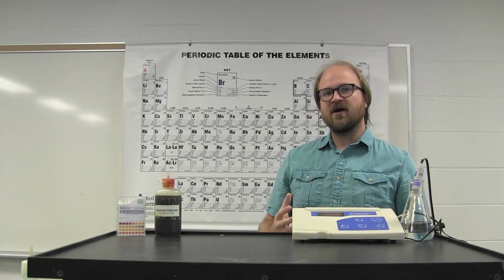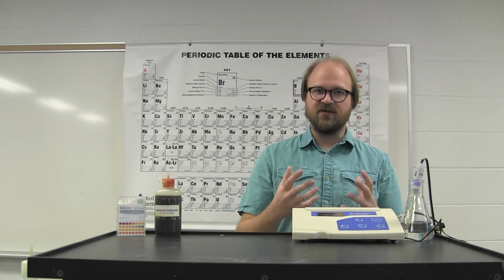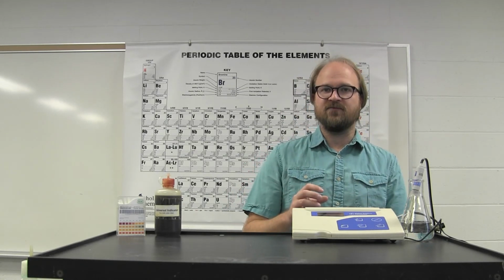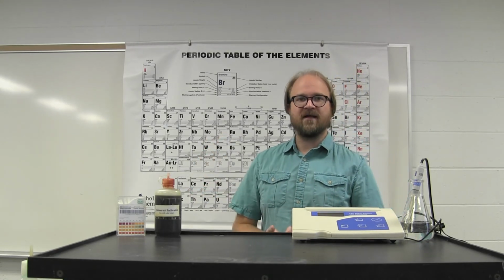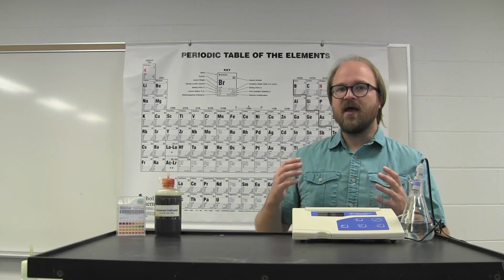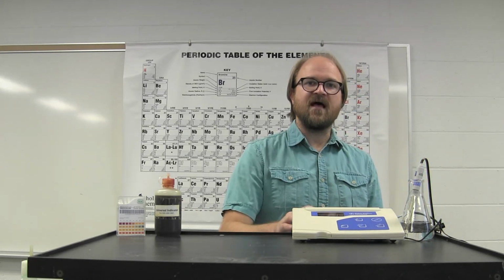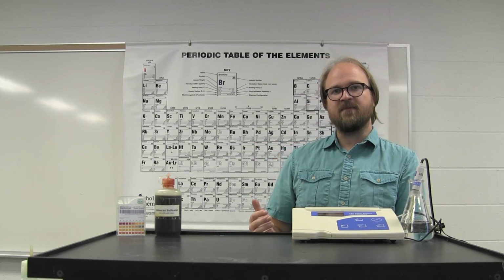In the end, this experiment predominantly looks at measuring the pH of a number of different solutions and converting that into the concentration of acid, that H plus concentration, as well as the concentration of base, the OH minus concentration. You're also looking at, from the pH measurement itself, developing the Ka and Kb for varying solutions of weak acids and weak bases.